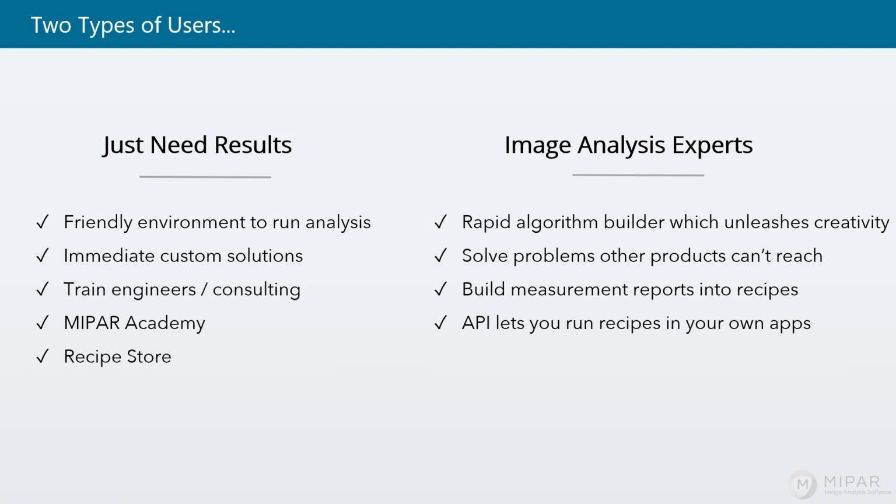On the image analysis expert side, the toolbox is an incredibly effective algorithm builder, again, very visual, very interactive, allows experts to perform a vast number of what-if scenarios in their quest for an effective algorithm, and we found that seasoned image analysts reach a level of creativity and solve problems that just weren't practical with hard-coding tools.